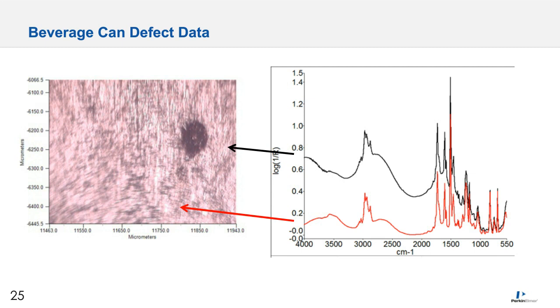The frequency of this pattern provides insight into the thickness of the coating. For thinner coatings, the spacing of the peaks and troughs will be broader, while thicker coatings will cause narrower spacing of the peaks and troughs. In comparing the frequency of the fringe patterns, we find that the coating around the defect has been made approximately 10 to 15% thinner.